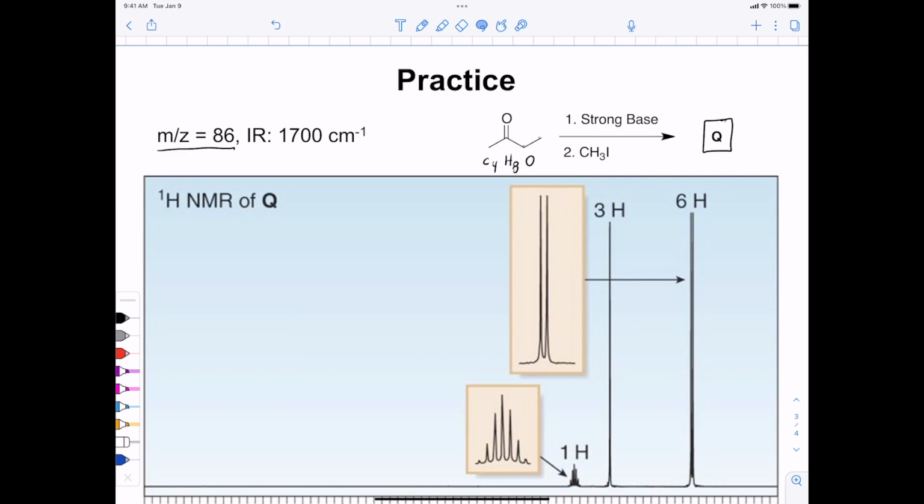But that's not how science works. Scientists just get started. They start asking a question, and they just get going and try to figure it out along the way. So don't worry if you can't look at that spectrum and say, I know what that is, because nobody can. This is science. We use the data to figure stuff out. So what I'm asking is, how did the molecular formula change when I went from here to whatever this is?